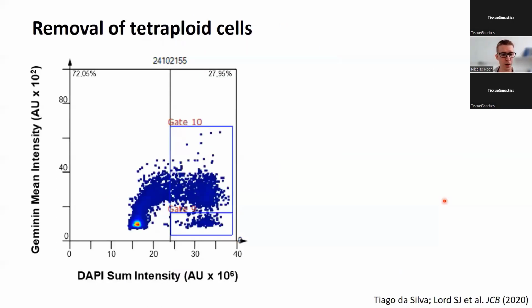In the process of this project, we also started wondering about this population of cells that we are calling G2. So the way we're gating out these G2 cells, we're just assuming that the DNA content of those G2 cells is double a G1 cell, and they're not incorporating EdU, so they cannot be in S. But we know that in tissue culture, at a perhaps quite low rate, there is a propensity for cells to become tetraploid in culture. And that depends a little bit on how normal your cell line is. But this does happen in culture.